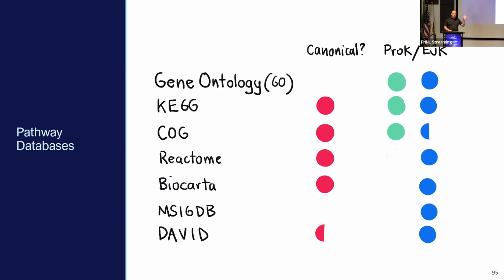And then below that, you have multiple different kinds of enzymes. So you have metabolic enzyme, you might have kinase, you might have something else. And then below those, you have subdivisions. The reason I'm telling you this is because if you are getting output functional enrichment from gene ontology, you'll oftentimes get all of these things, right? You'll get enzyme being upregulated, you'll get metabolic enzyme being upregulated, you'll get serine threonine transferase, whatever, being upregulated. And it can be difficult to kind of judge what level you should be looking at in terms of interpretation.